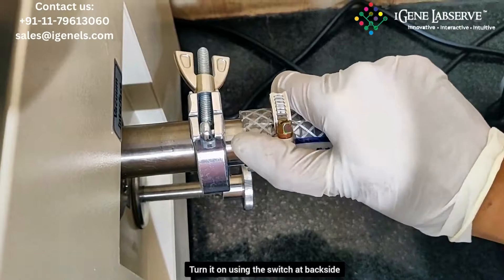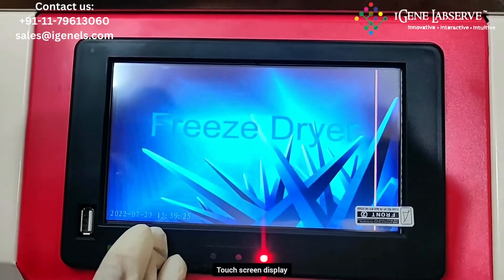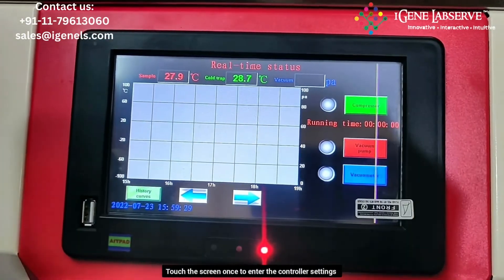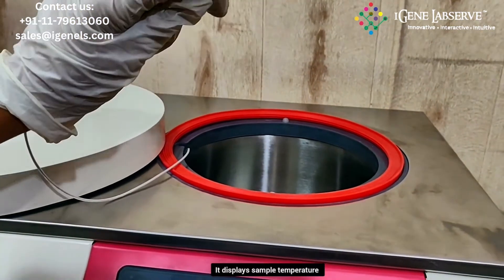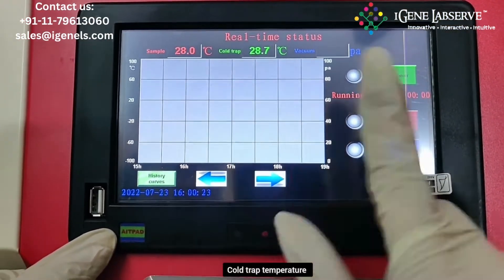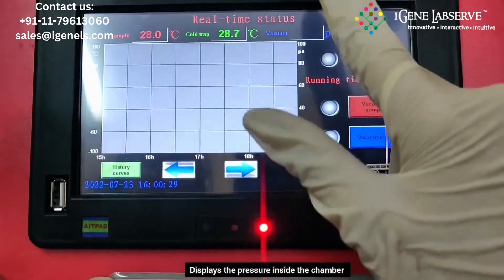After connecting the pipe, you have to turn this on to the back side. This is the main display. You have to touch this once and the main screen opens up. Here it displays the sample temperature, which is measured by this particular sensor. This is the cold trap temperature. This here shows the vacuum or the pressure present inside the chamber.